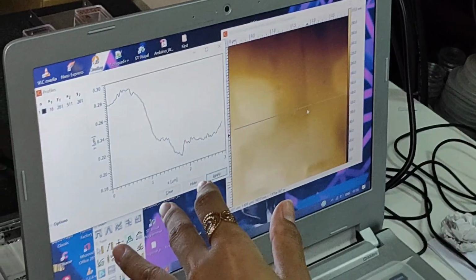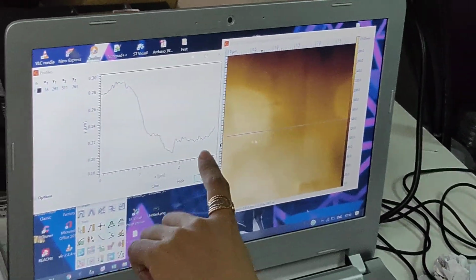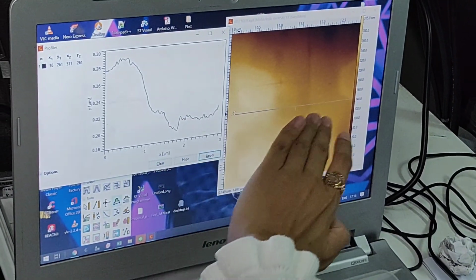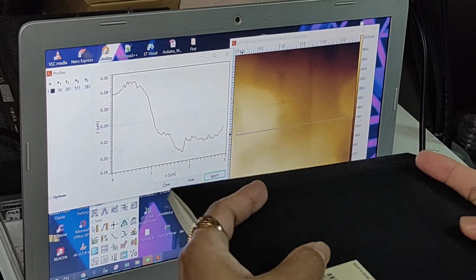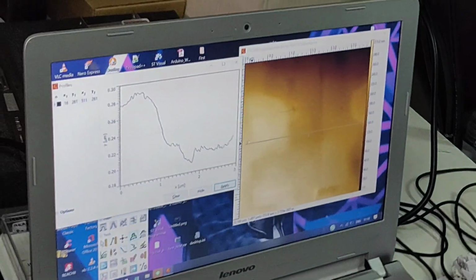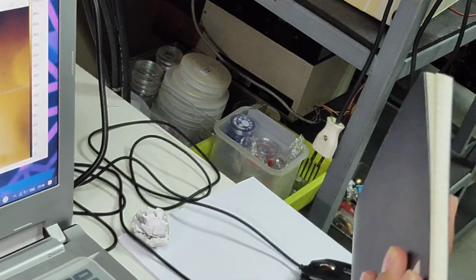In here, the surface looks flat, right? Only in some area there is a plaster. But in reality, I think this side is higher and this side is lower. So it means when we are scanning AFM, maybe your sample is a little inclined, because we have the indium glue at the back side of the sample.